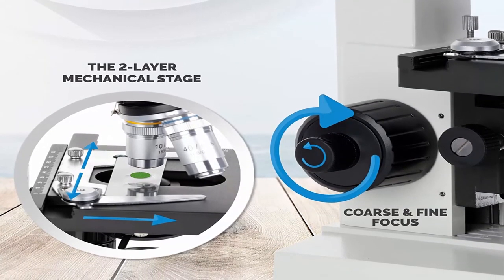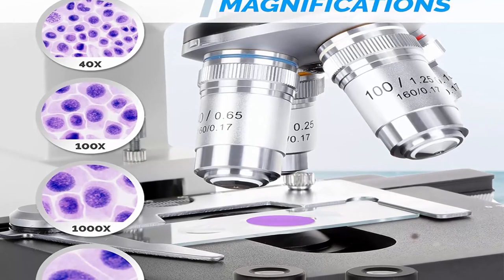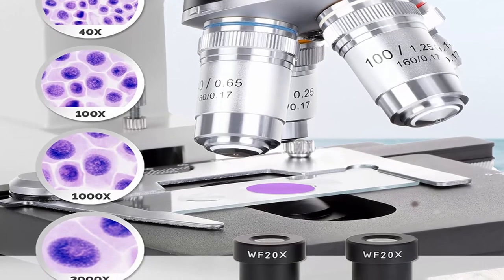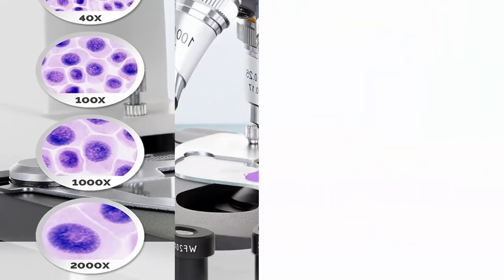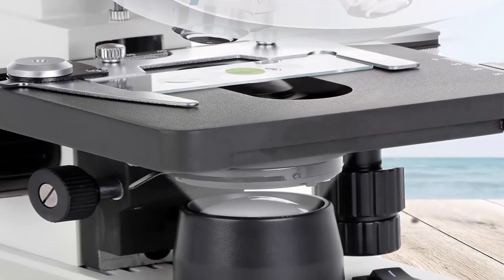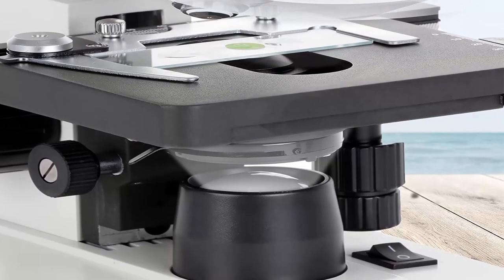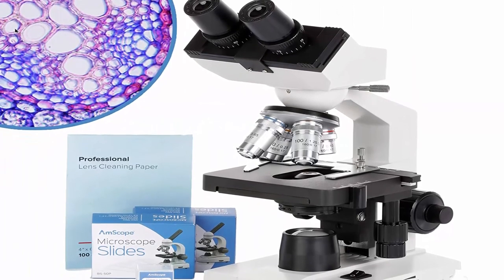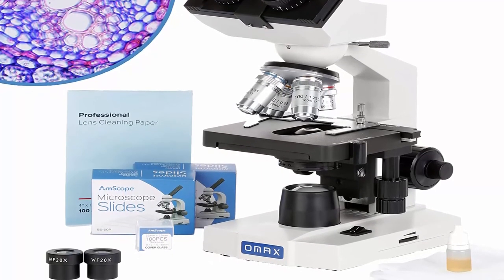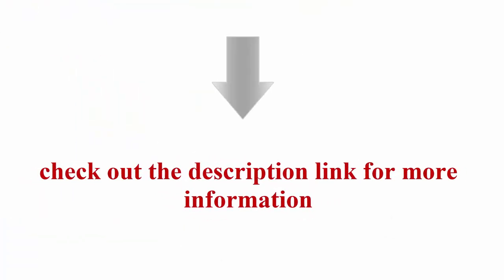Stage upward-moving lock protects objectives and slides. Condenser: NA 1.25 Abbe condenser with iris diaphragm. Illumination: transmitted lower LED light with adjustable intensity. Focus: coaxial coarse and fine knobs on both sides. Full solid metal frame construction with stain-resistant enamel finish. Power supply: AC-DC adapter, UL approved, input 100–240V. Includes 100 blank glass slides, 100 cover slips, and 50 sheets of lens cleaning paper. Check out the description link for more information.